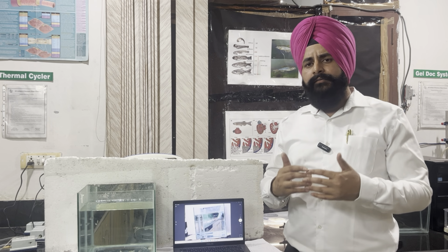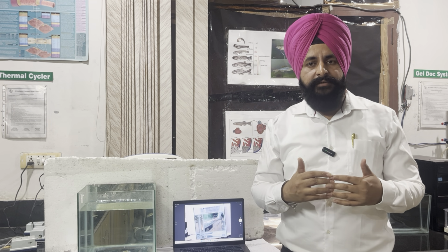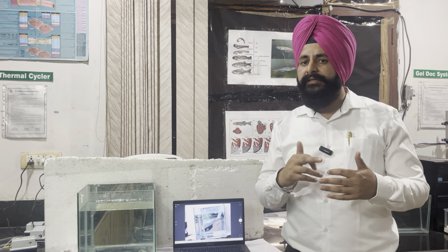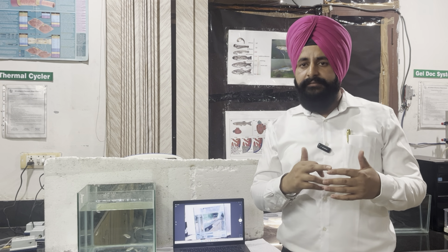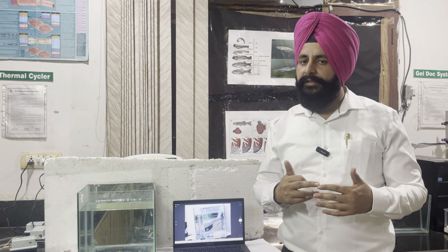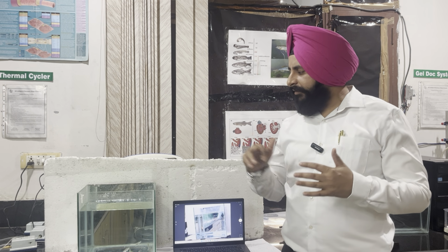Now, what is the aim of this experiment? The first aim is how you can induce anxiety-like behavior in the zebrafish. That means how you can induce acute anxiety, and how you can induce chronic anxiety.